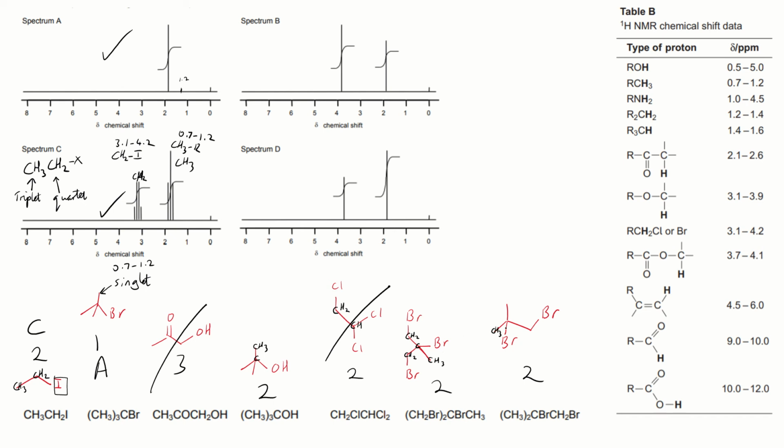Across here, CH3, C in there. Again, as we can see, there are no hydrogens on adjacent carbons for either of those two environments and no splitting there. So we've got 3 molecules, 2 spectra left.